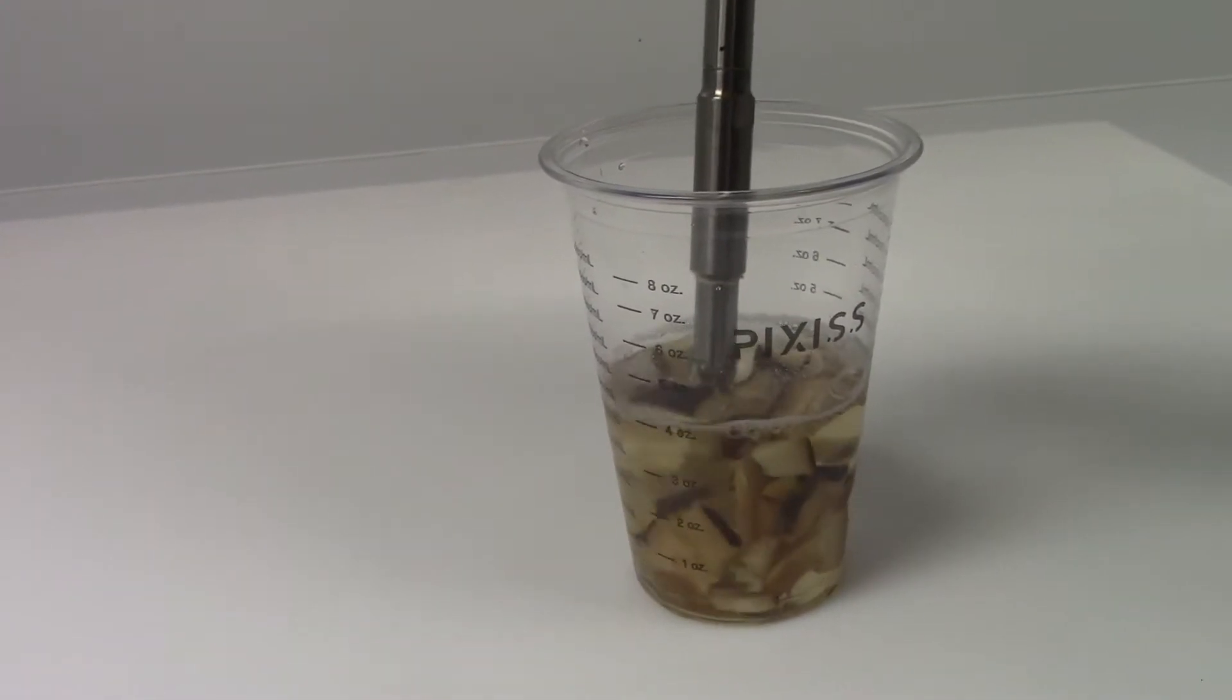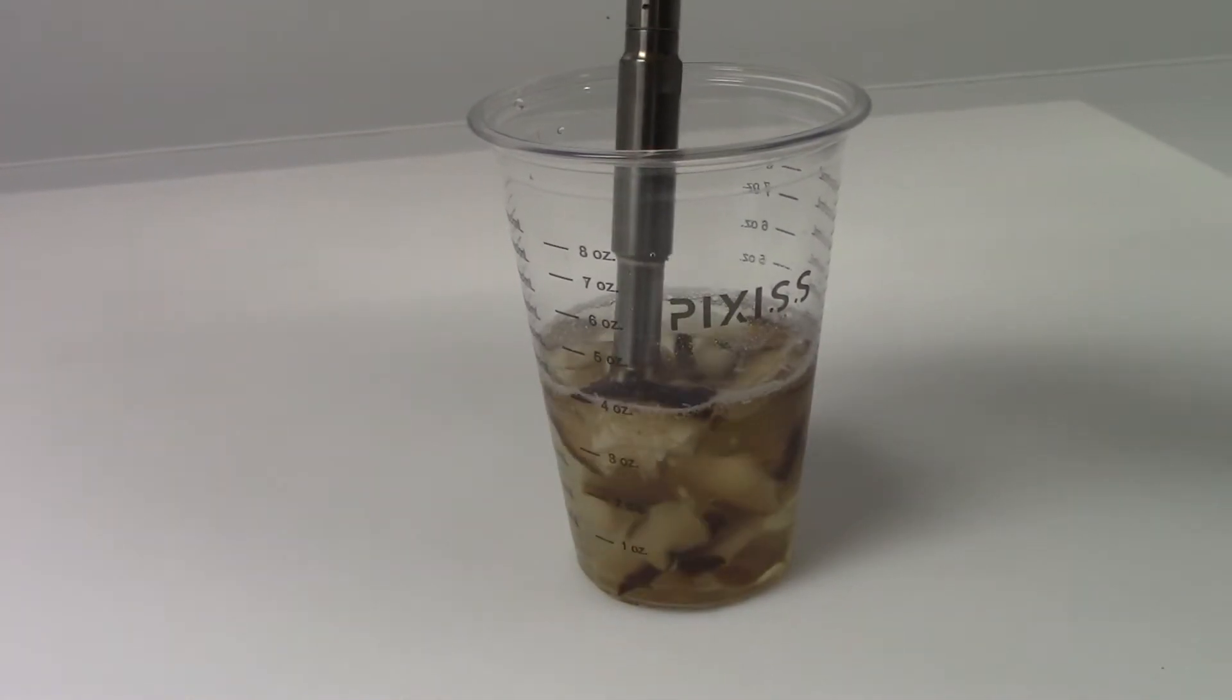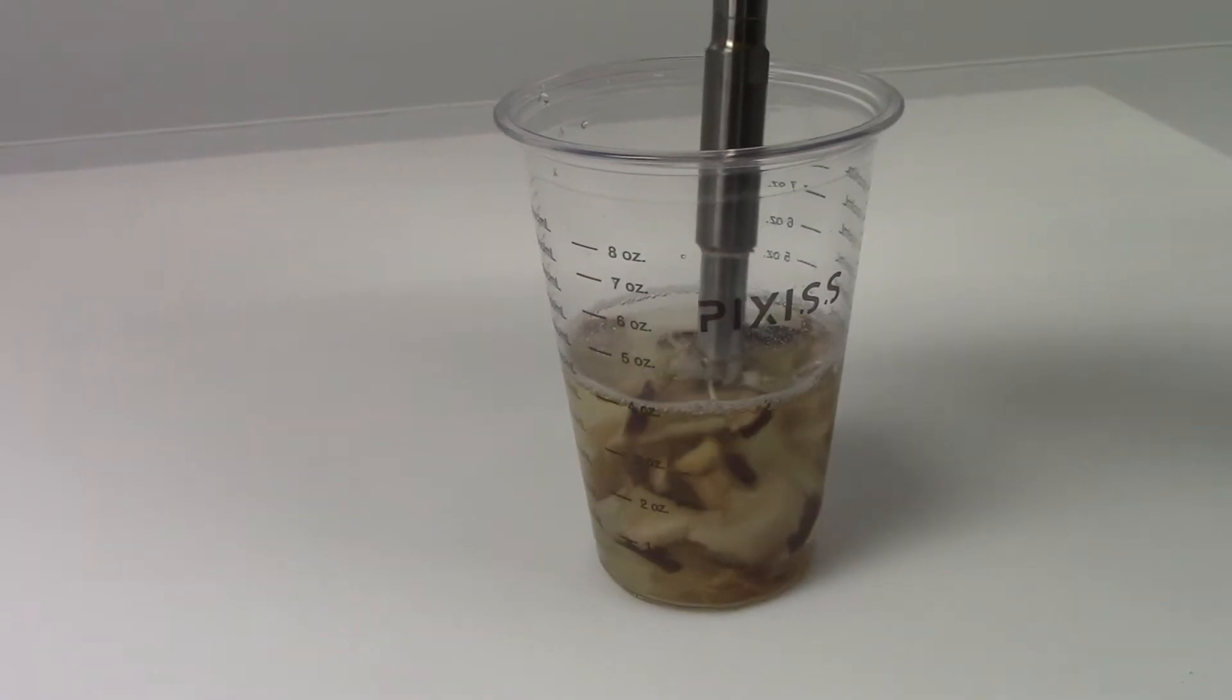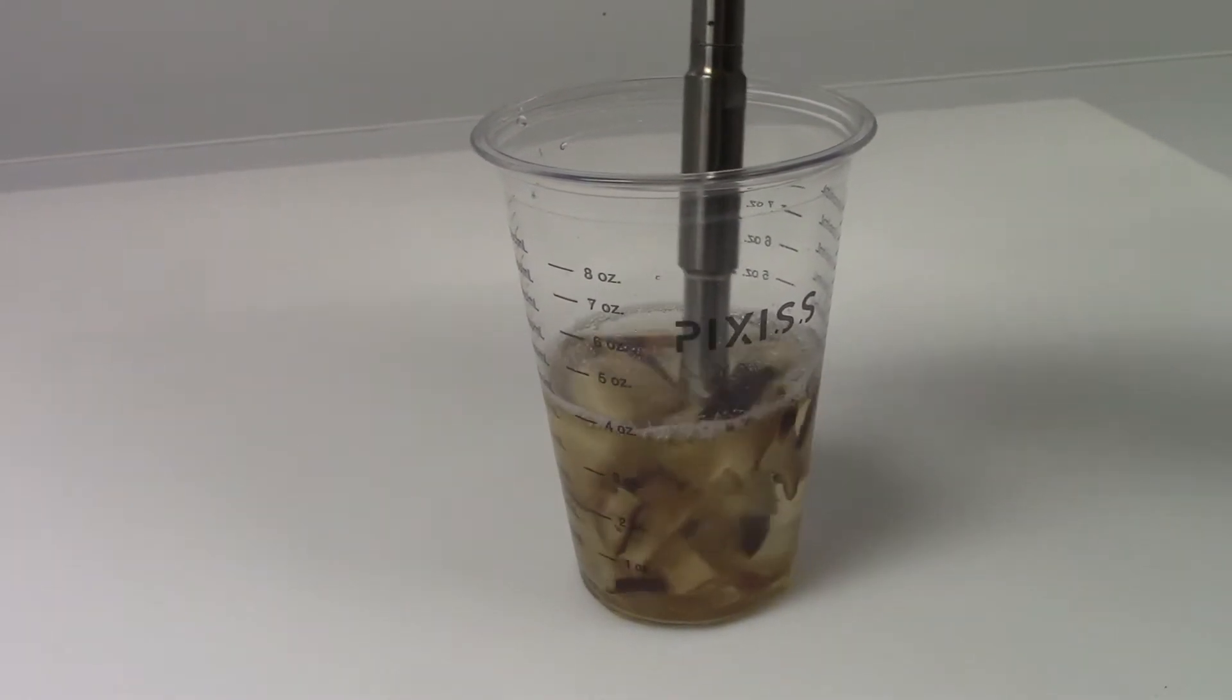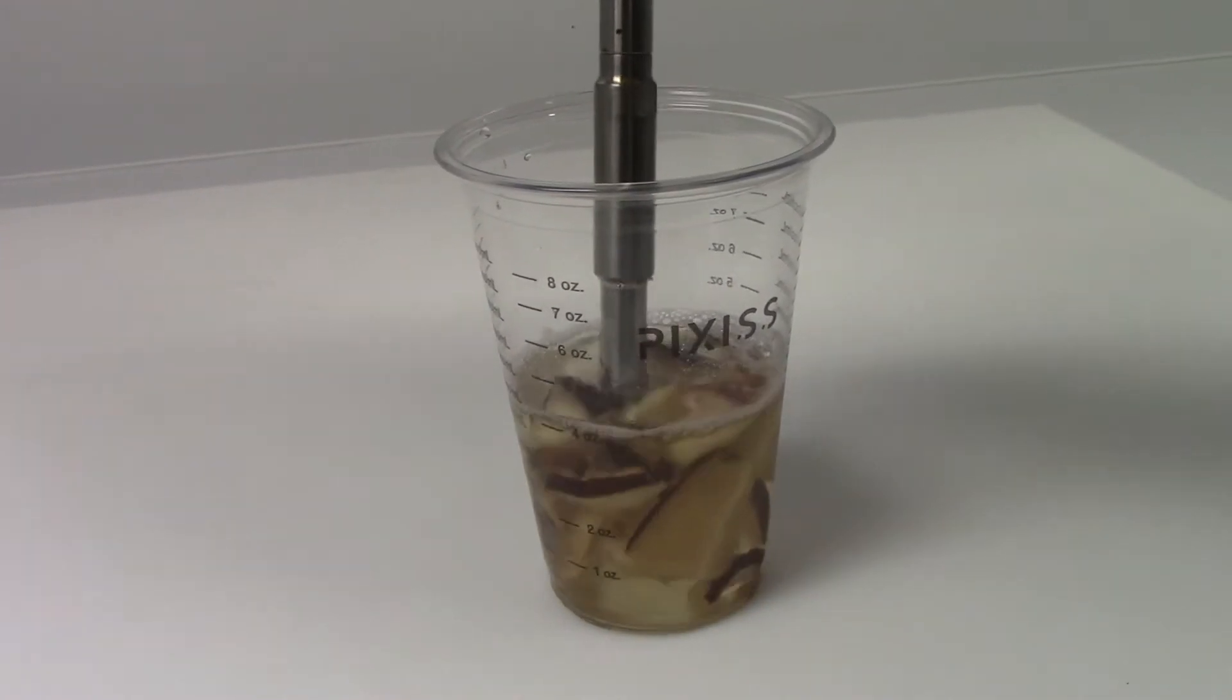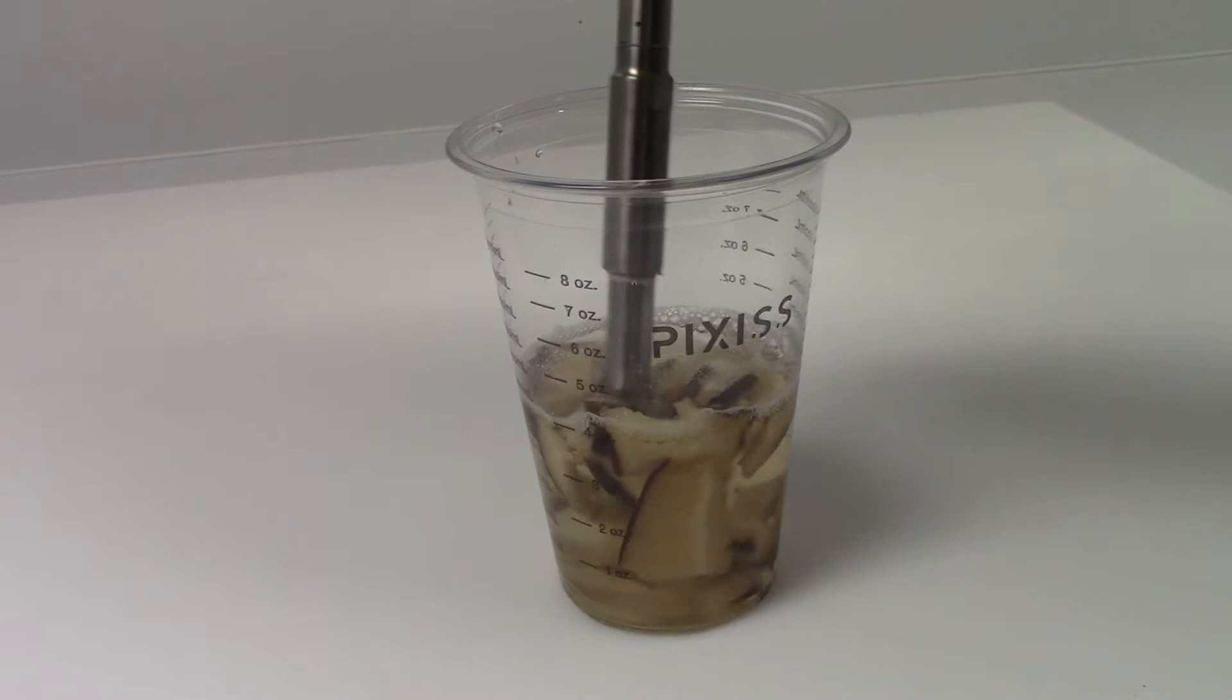We're using dried mushrooms. And the cavitation field, as it hits the mushrooms, is ripping the cellular wall, causing the extraction into the solvent. There are many different solvents used on the marketplace.